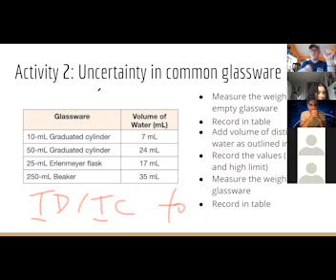It does something at 20 degrees Celsius, which is basically what we usually think of as room temperature. It will do 2 things at 20 degrees C. One of them is a D and one of them is a C.